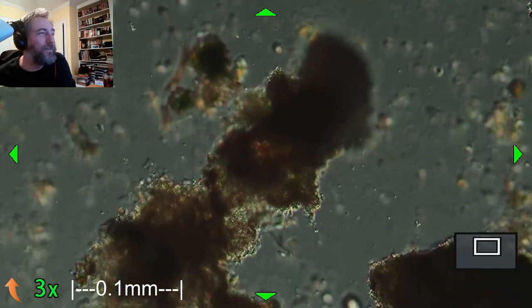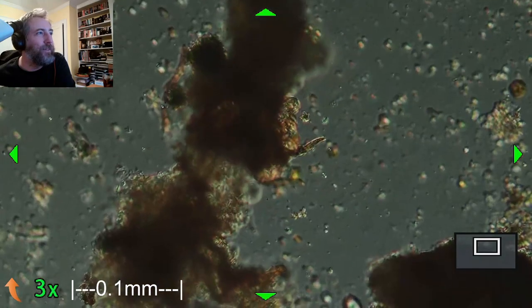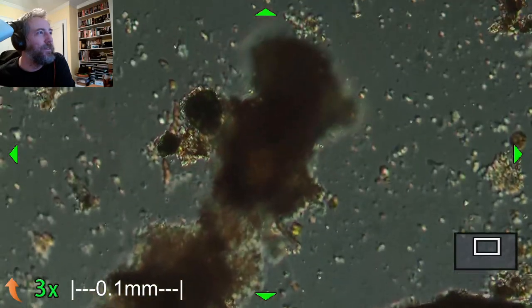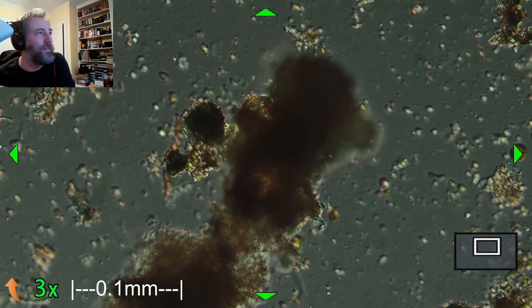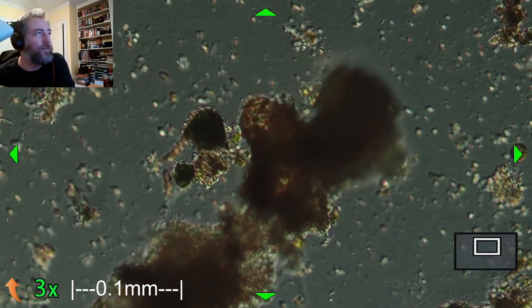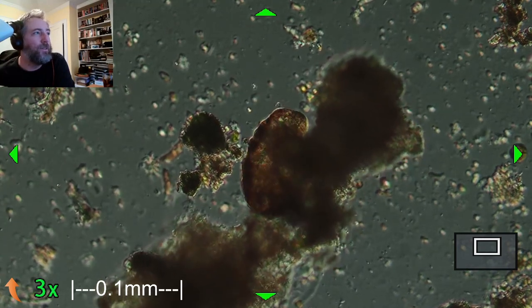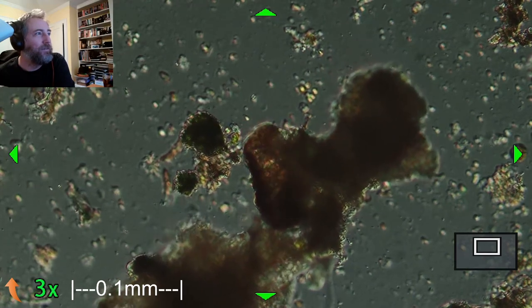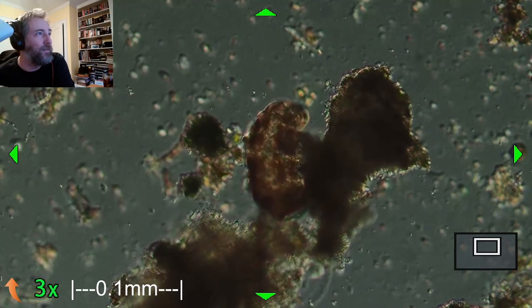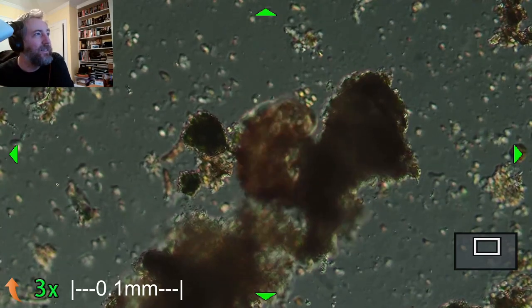Never considered filters? Well, filters are kind of the cheap way of doing things. Changing the light source is probably a little bit more authentic. And you can change the individual red, green, and blue independently. So you could sort of get whatever kind of color combination you want. It might actually make for better pictures than a filter, because a filter is only going to give you sort of a solid one color usually.